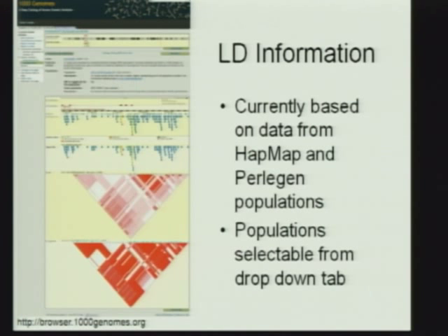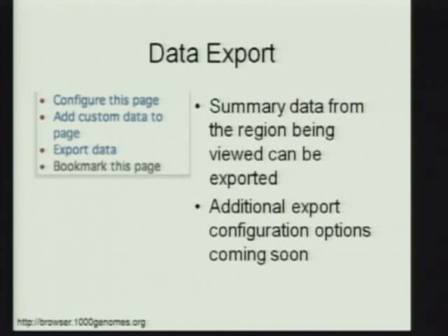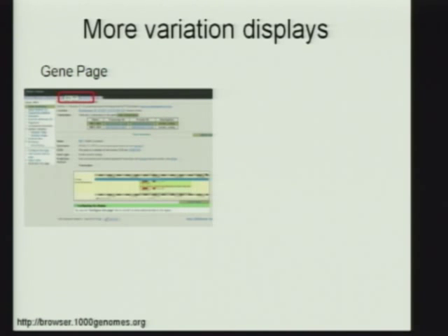You can view linkage disequilibrium information in context with the SNPs. Currently we calculate the linkage disequilibrium from the HapMap and the Perlegen populations, and the populations to view this are selectable. I also talked a little bit earlier about data export — this provides summary data from the region being viewed, and we're going to work on some additional export configuration options to make this a little bit easier to use, to pull out just a small chunk of the genome or a small chunk of the SNPs.